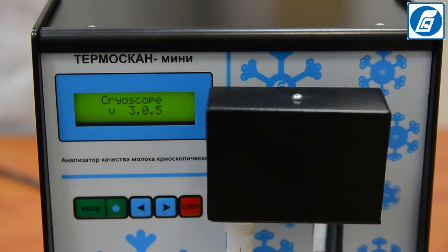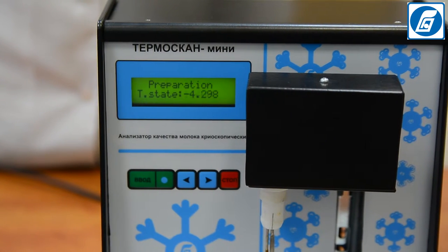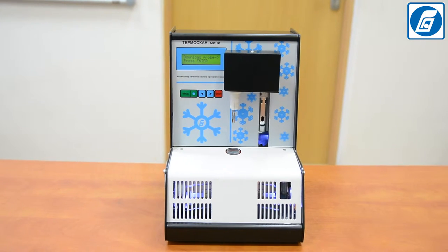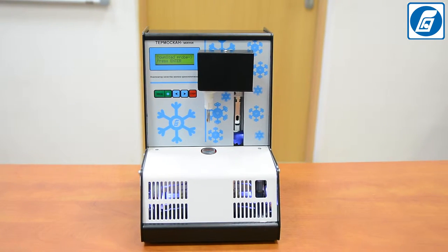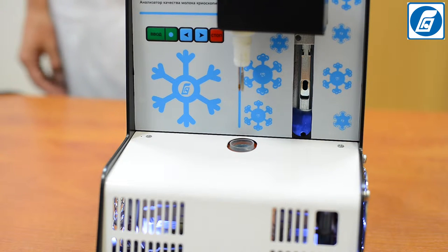The following messages will appear on the analyzer's display: the analyzer's model, the software version, and the serial number. Leave the analyzer switched on for 30 minutes to establish the operating mode.